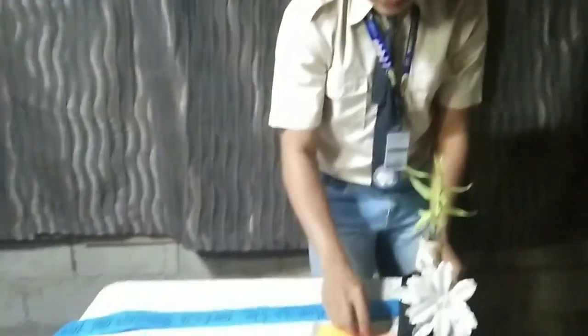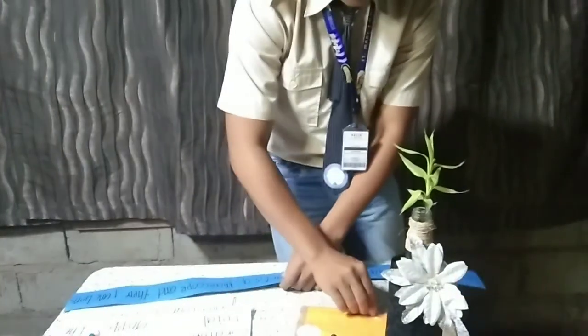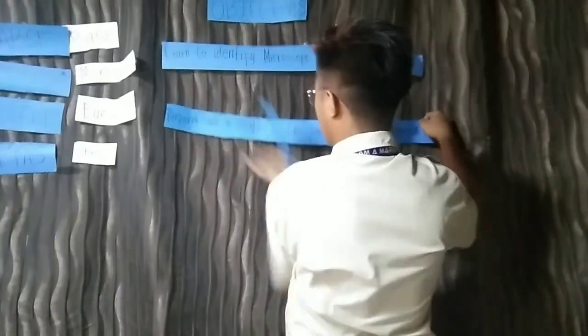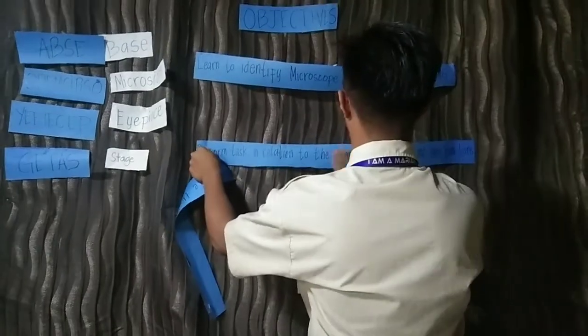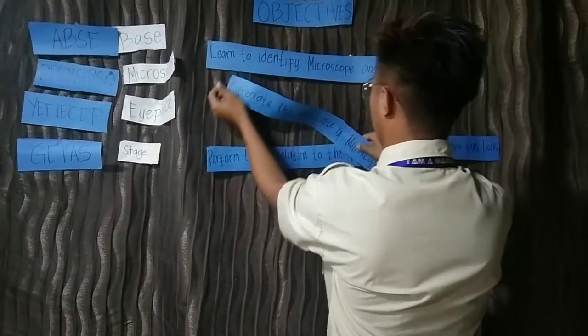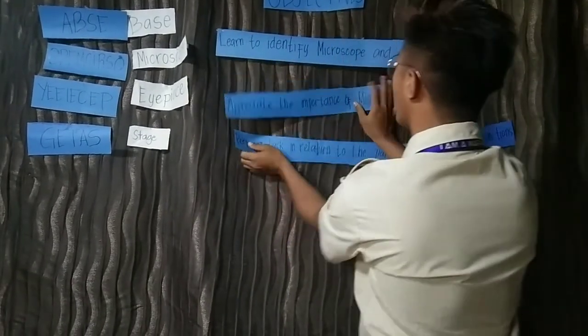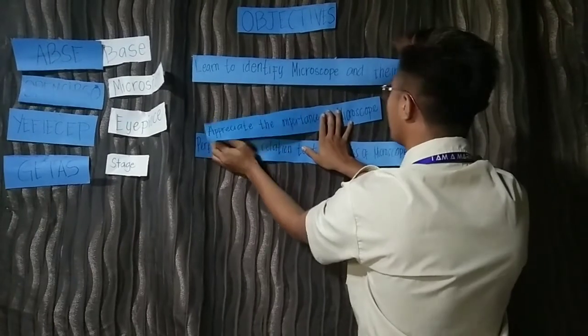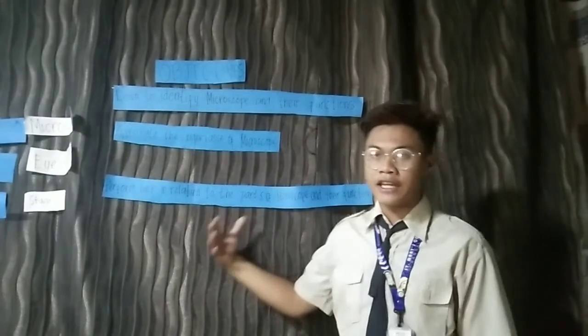And the last objective is to perform tasks in relation to the parts of the microscope and their functions.